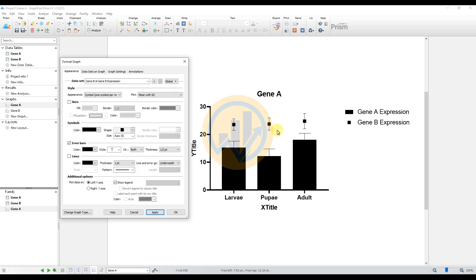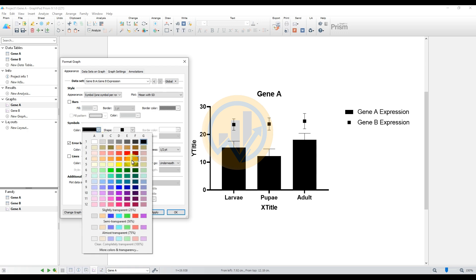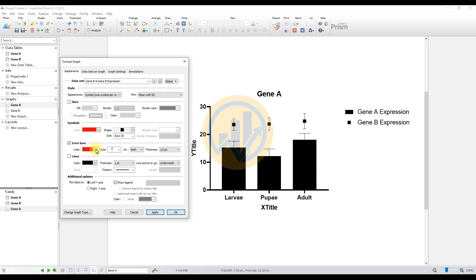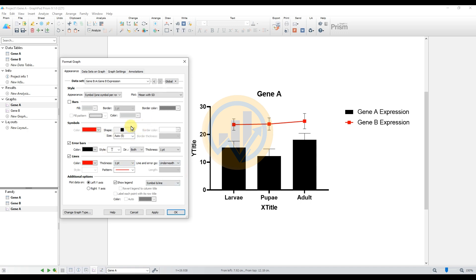Now change the colors for Gene A and Gene B. First, select data sheet for Gene B. Change the symbol color to red, change the error bar color to black, and change the line color to red. Click the checkbox to enable the line, then click Apply. Set the error bar thickness to 1, select both-side error bars, and set the line thickness to 1.